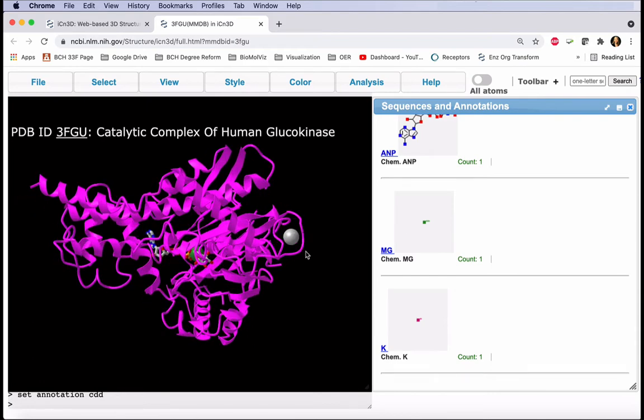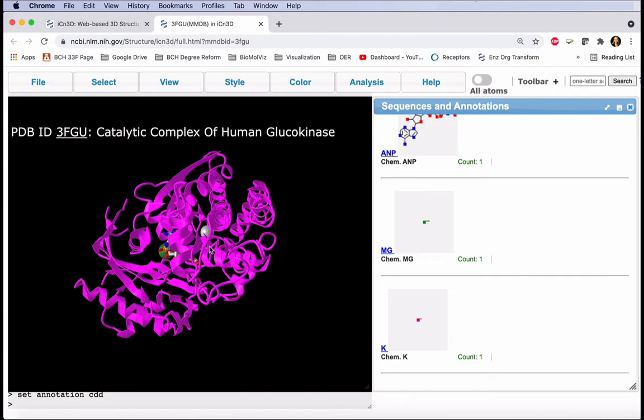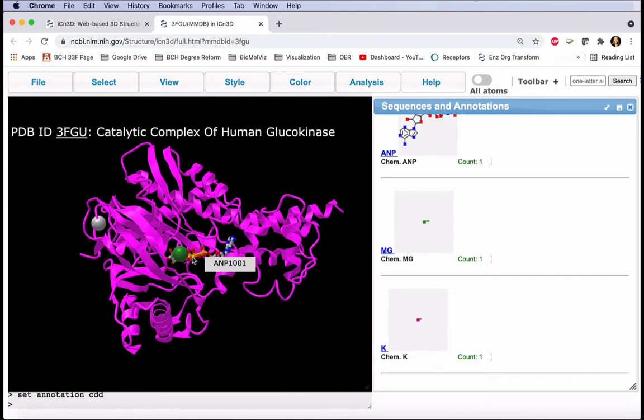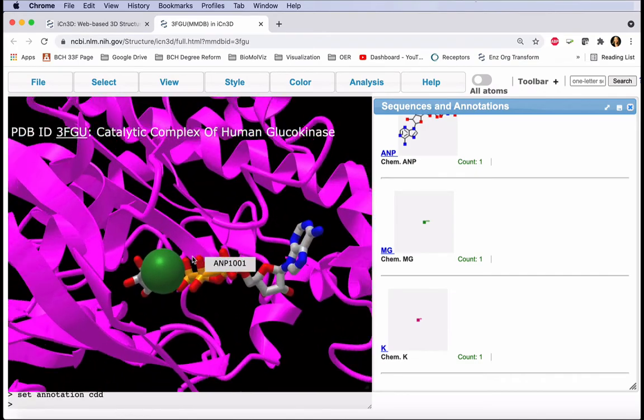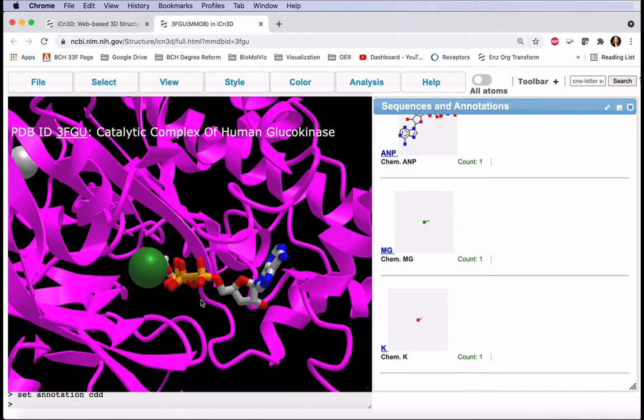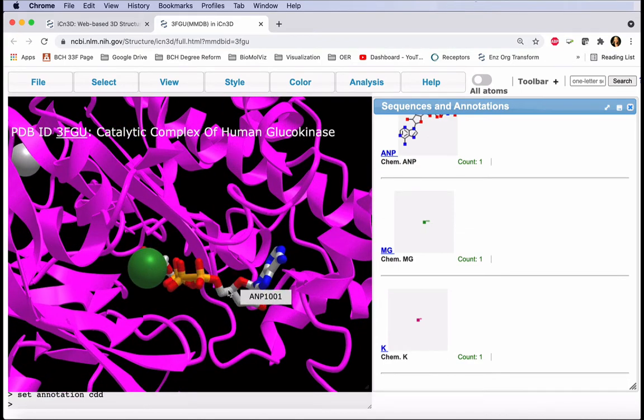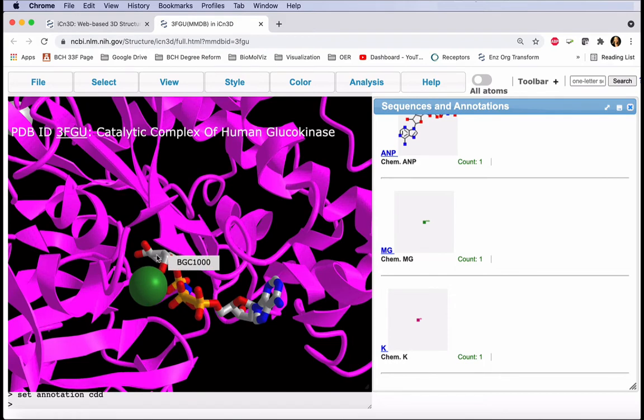Here is our ligand that is outside of the active site. If we hover over that, we see the K, identifying it as our potassium ion. The rest of the ligands are in our active site, and we can hover over each of these ligands to view its name.